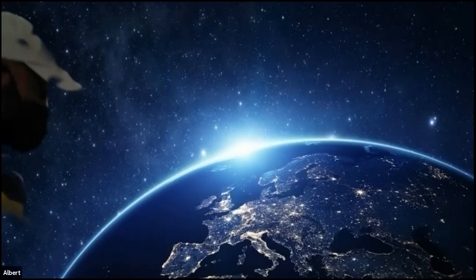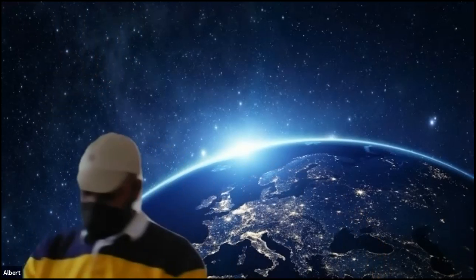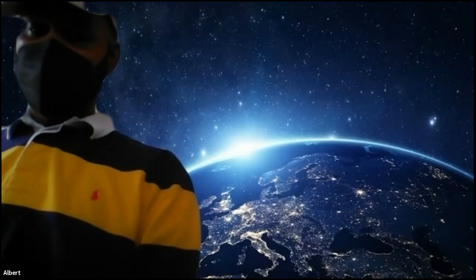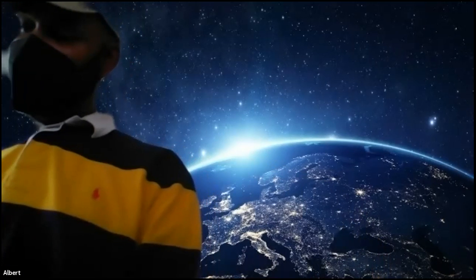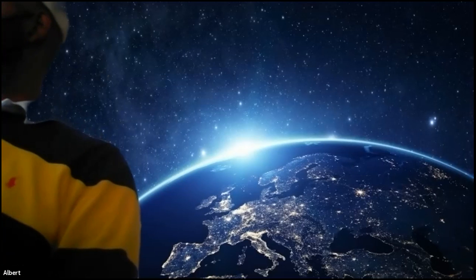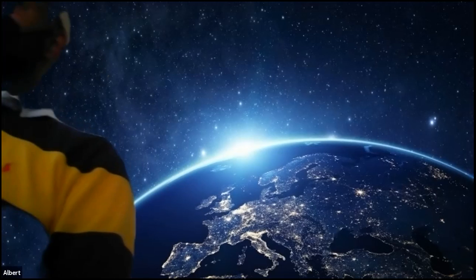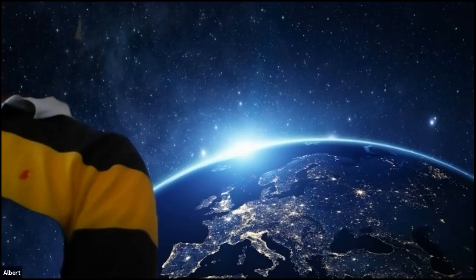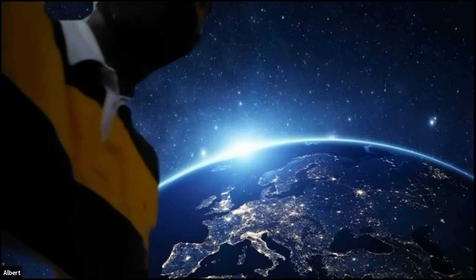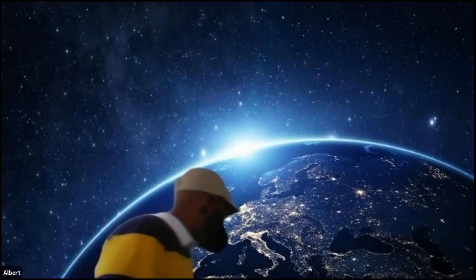So I'm going to bring samples around to each group. This is an example of what I'm talking about. If you can see the difference, how dry and clumpy that looks. That's not good compared to that one, which is all shiny and shimmery. This one is probably not great, but when we recrystallize it, that'll help. That'll make both of them pure, right? So I'm going to leave that with you. You can take that sample and save it. It's brand new right now.